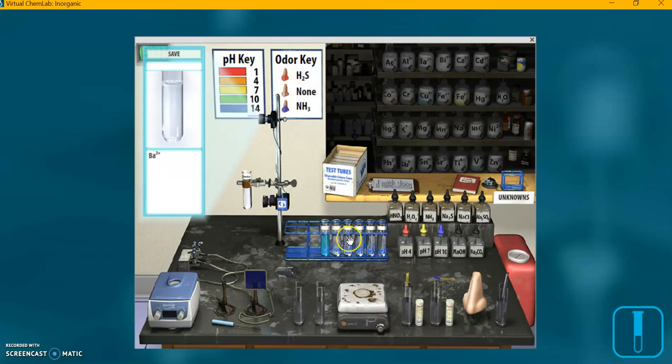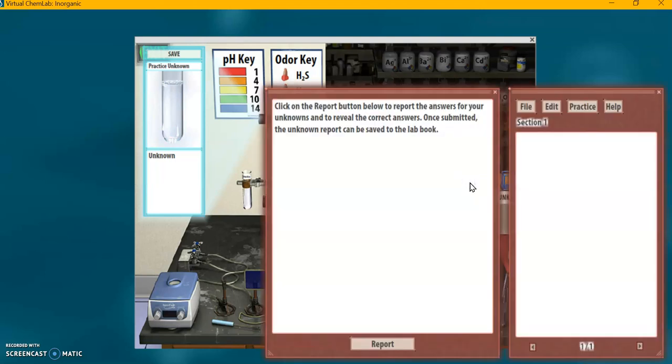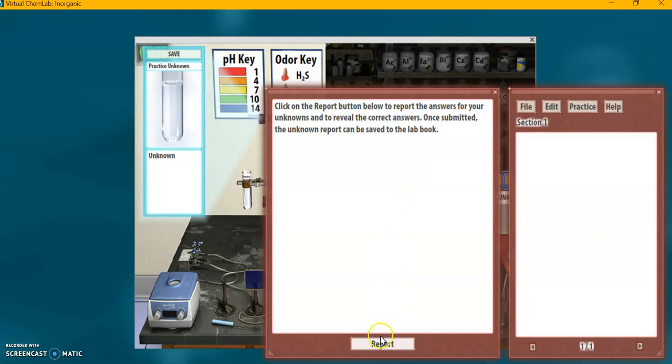You can repeat, like I said, you can repeat any of these to compare until you feel confident that you know what this one is. Now I'm going over to the lab book here, I'm clicking on that, and that opens that up. And click the report button down here. You can read that first.